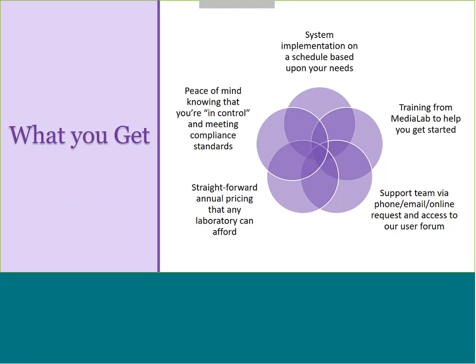The training and support team from MediaLab is just wonderful. They're available via phone. We have a ticket system. We have an email system where you can get to the support team. They really are wonderful. Our response time is super quick. And any time that I ever had issues as a client, getting an answer from MediaLab right away was never a problem.